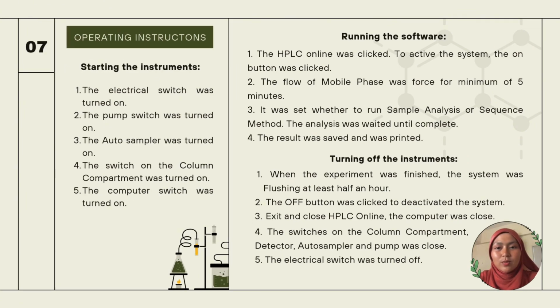To start the instrument, first, the electrical switch was turned on. Second, the pump switch was turned on. Third, the autosampler was turned on. Next, the switch on the column compartment was turned on. Lastly, the computer switch was turned on.